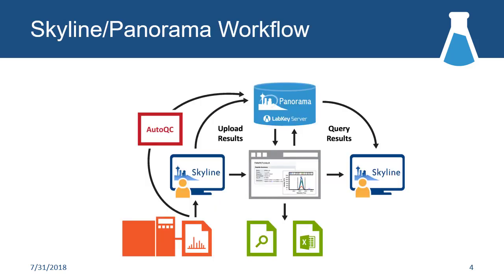So the overall life cycle of using Skyline and Panorama together is that generally you're always starting with Skyline, or someone has started with Skyline, and then you can piggyback on the work that they've already done.